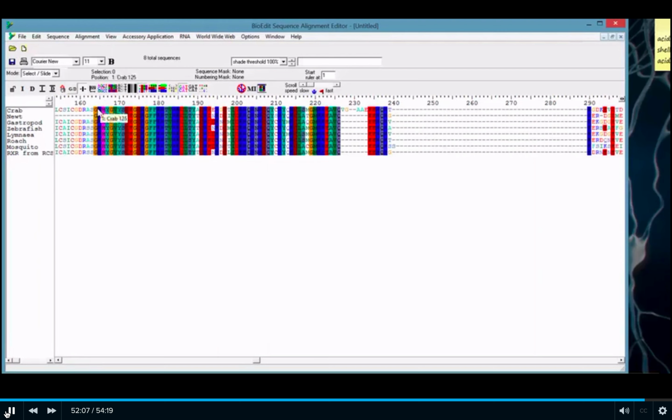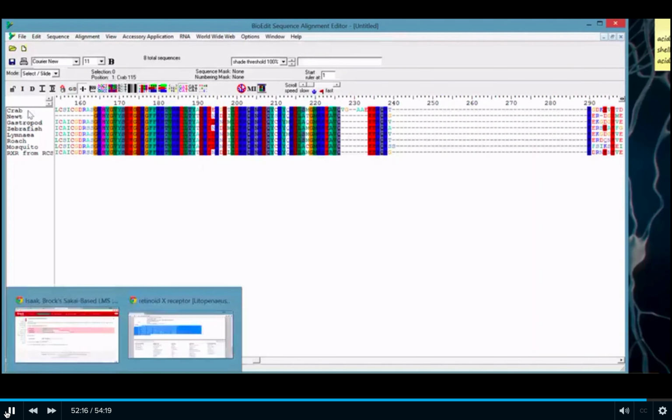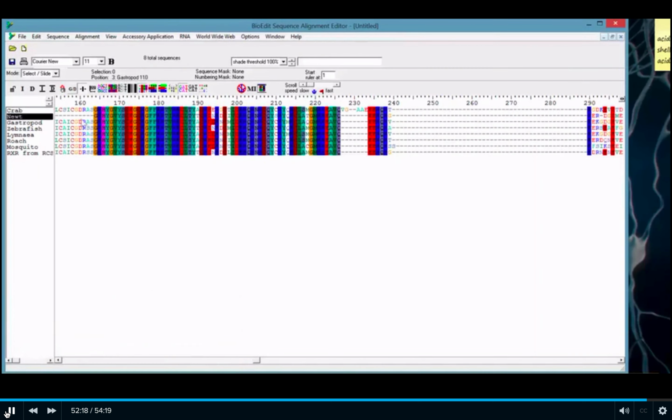And from this, I can see the residues, and hopefully from one of these, I'd get the very specific PDB file. You'd want to make sure on NCBI you can get the PDB file from this. Let's say I had the one for newt. I can go in and say, okay, well, residues, in this case, actually, let's not use newt. Let's say gastropod. Residues 120 through to 145 are incredibly important. I could highlight those on the PDB file and actually see what they do. And then from here, I can make reports showing why these are conserved.